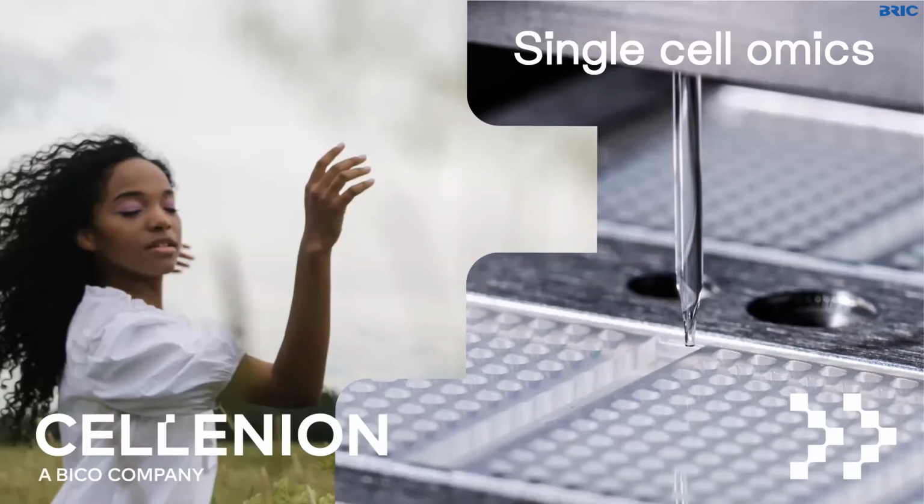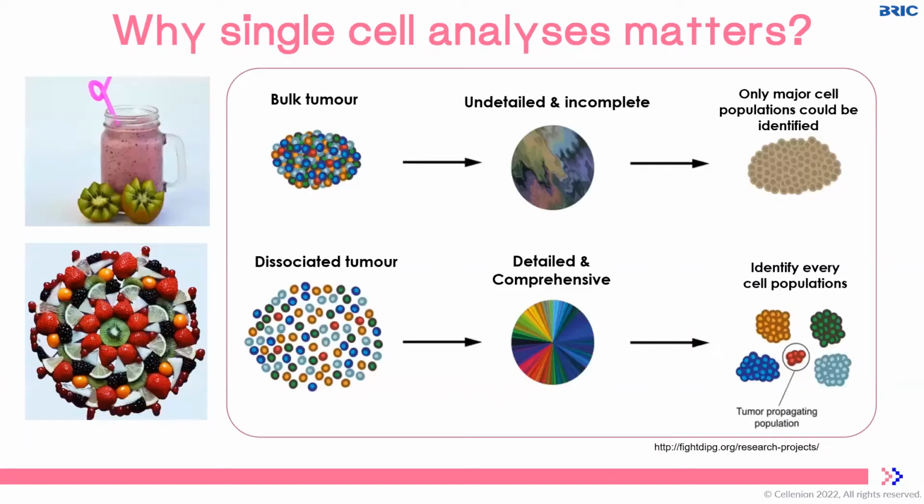What do we do with our technology in the field of single-cell omics? For those of you who are familiar with single-cell analysis, you will probably have seen this little representation of the benefits of a single-cell analysis. We take this example of the smoothie and the fruit salad. In a smoothie, everything is mashed up, so it's very difficult to identify all the fruits contained in the smoothie.